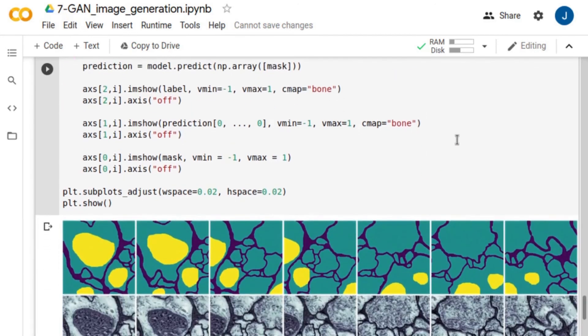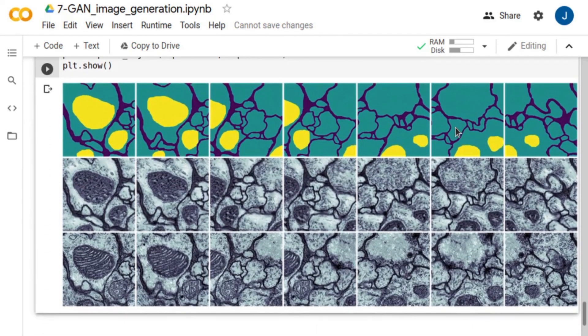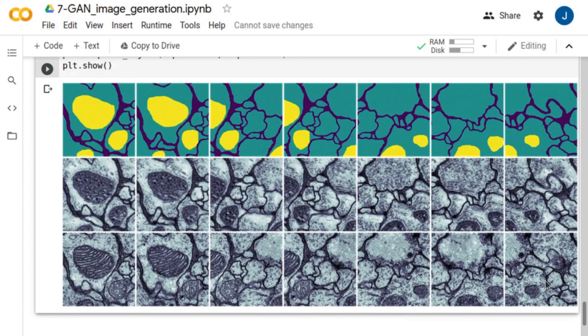Here, we have several results. These are the input noisy masks, the prediction of the neural network, and the ground truths. Note that the generated images are visually similar to the images from the experimental dataset.